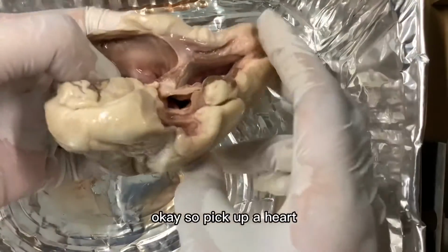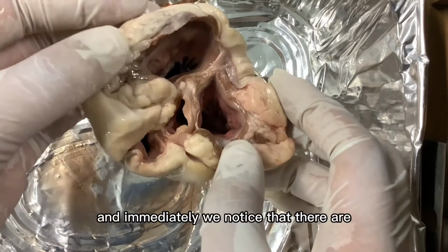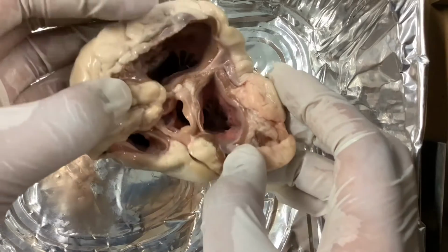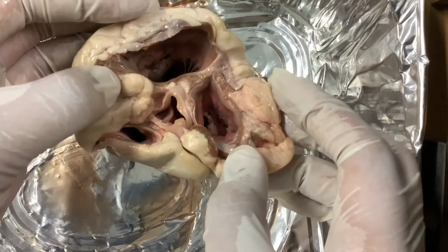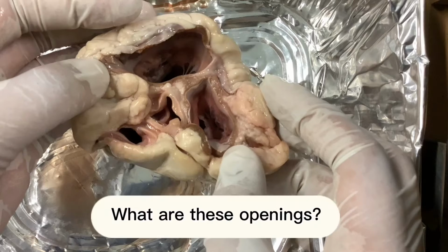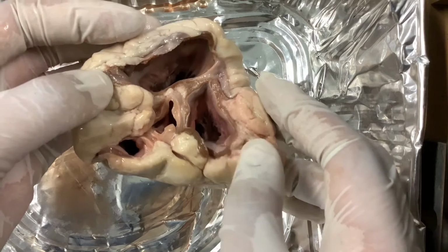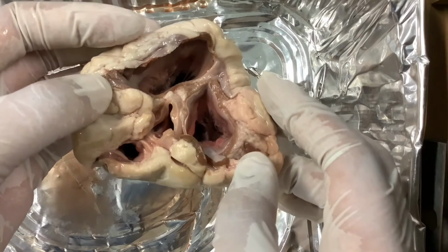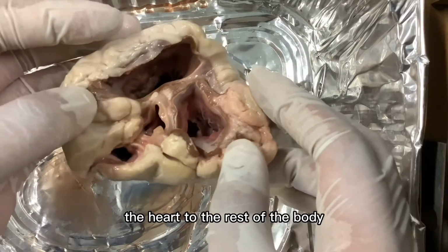Pick up our heart and observe the top, and immediately we notice that there are 4 openings here. I'm going to let you guess what these openings are. If you guessed that these are the blood vessels that connect the heart to the rest of the body, then you are correct.